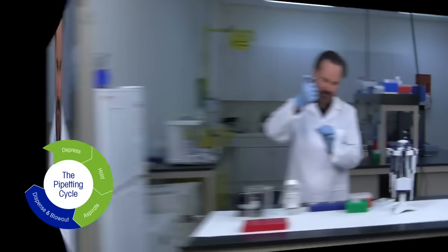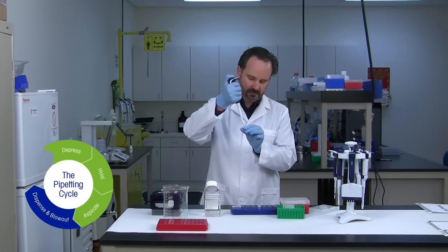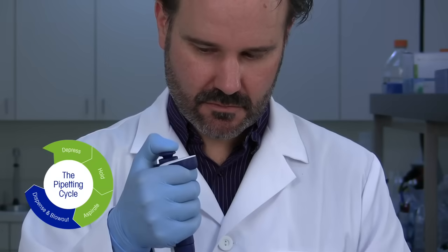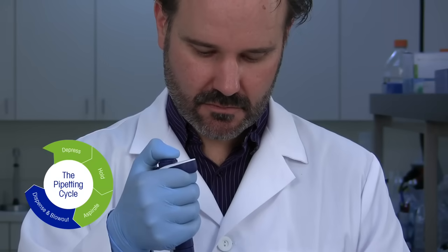Step 4, called blowout, expels any sample remaining in the tip. Push the plunger past the first stop to the second or bottom stop.